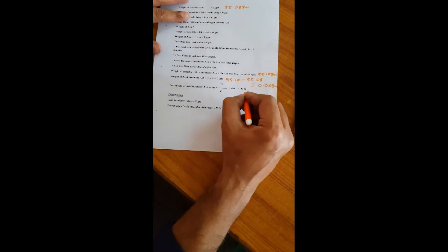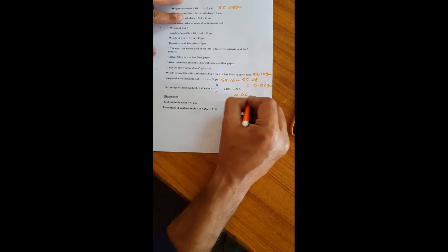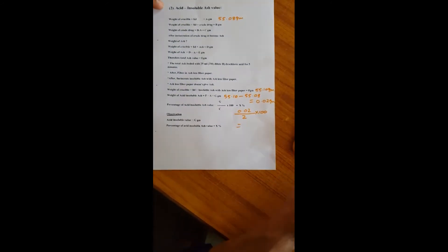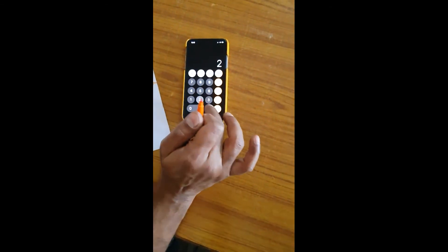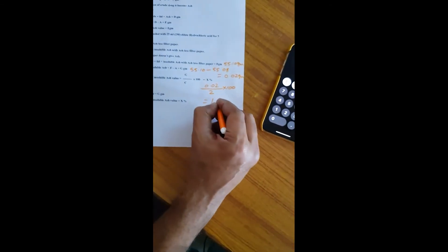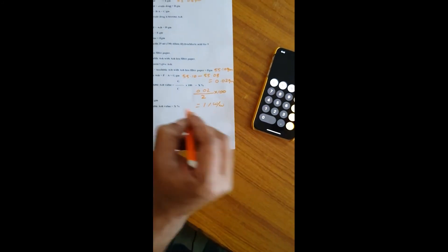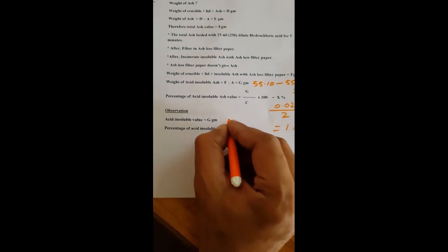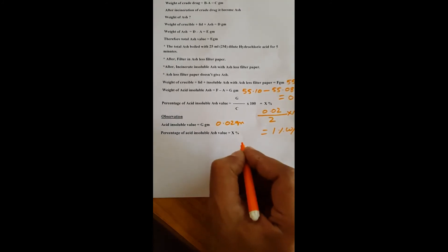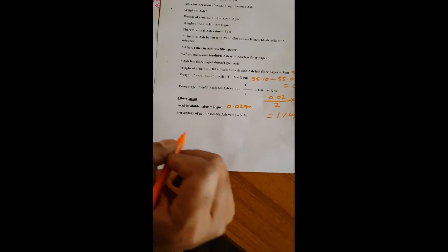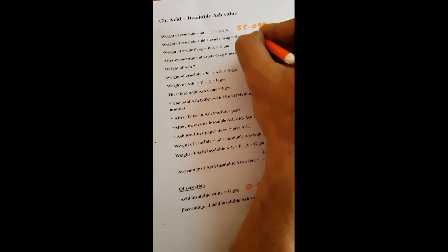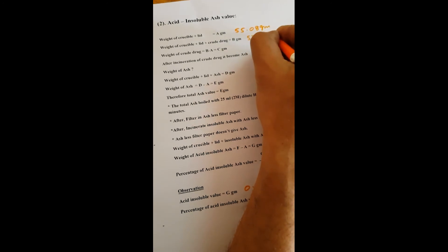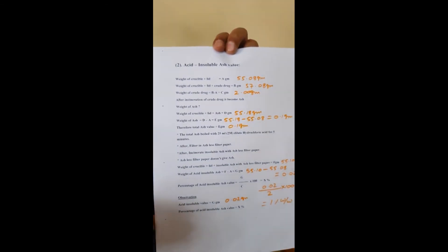So the weight of the acid insoluble ash is 0.02 grams (F minus A: 55.10 minus 55.08). The percentage of acid insoluble ash is 1% weight by weight. So acid insoluble ash value is 0.02 grams and the percentage is 1% w/w. This is the continuation of the total ash experiment. Like this, this is how you perform the acid insoluble ash determination. Thank you.